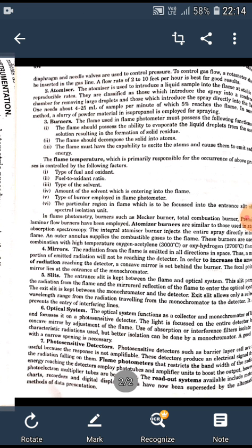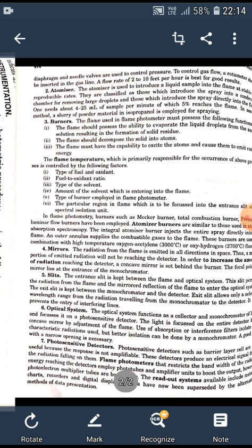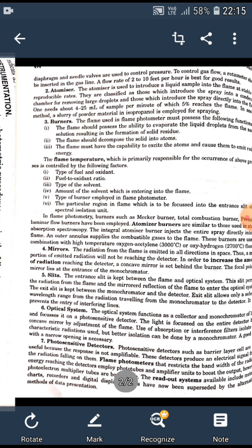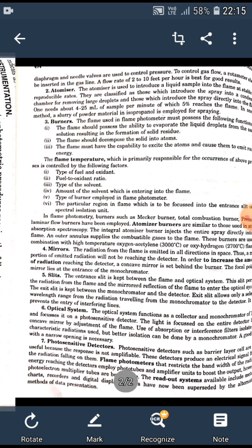The instruments available are both of single beam and double beam type. Single beam flame spectrometers contain only one set of optics. The light emitted from the flame is collected by a reflector and focused by a lens through optical filters into a single photo detector. Or the light from the burner passes into a monochromator and radiation leaving the exit slit is focused onto the detectors.